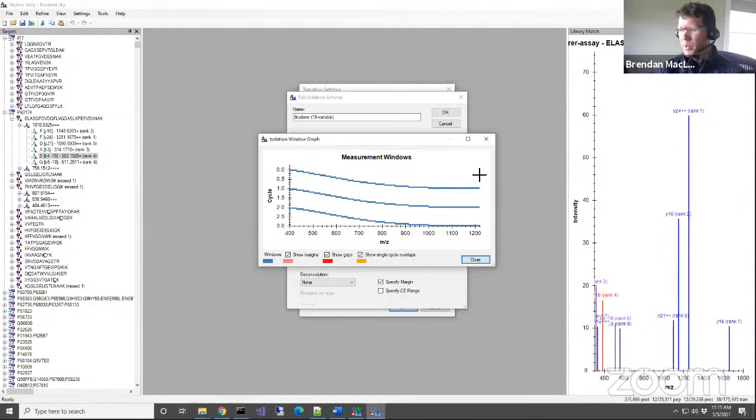So actually an Exploris. Does an Exploris have a quadrupole? I mean, does it not have a quadrupole? Does it have an Orbitrap? I'm not totally on top of that. Is an Exploris a hybrid, or an ion trap with a quadrupole? Does anybody know? Juan, anybody?